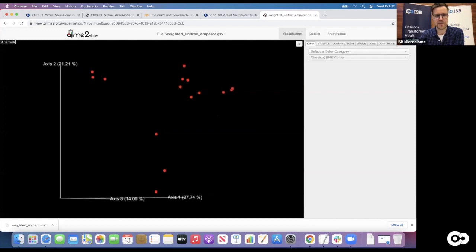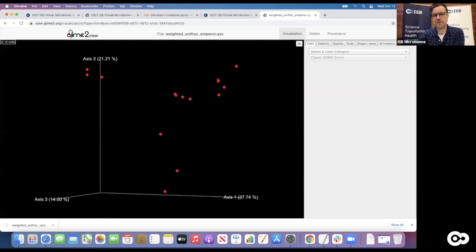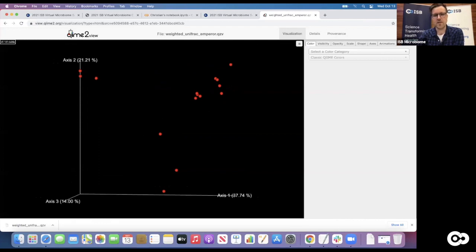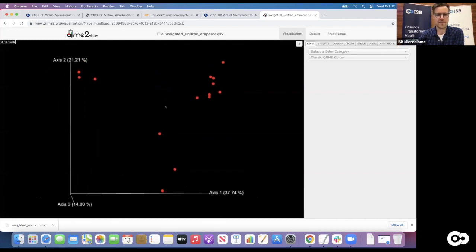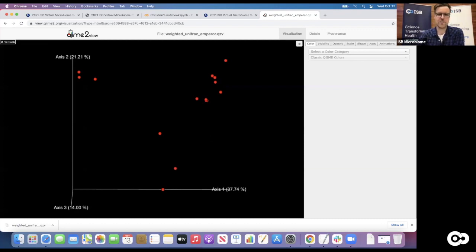Each dot here is a single sample, and those are arranged with principal coordinate analysis in a way that's really consistent with the distances from the beta diversity. Points with low beta diversity to another point are basically close to each other, and we do see some clustering. On the axes themselves, you see the percentage of variance explained - the first separation axis explains almost 40 percent of variance, the second one 21 percent. Those two axes together explain something around 60 percent of the total variance. If we take in the third dimension, we go to almost 75 percent - three-fourths of the total variance explained - that's pretty good agreement.